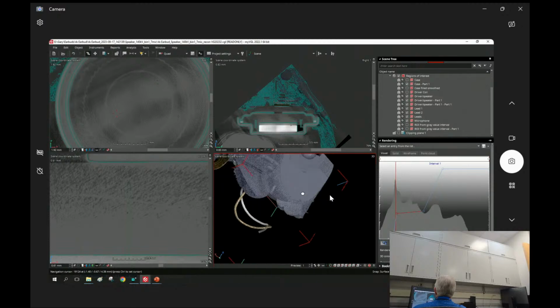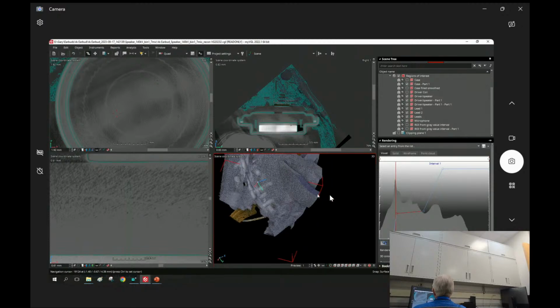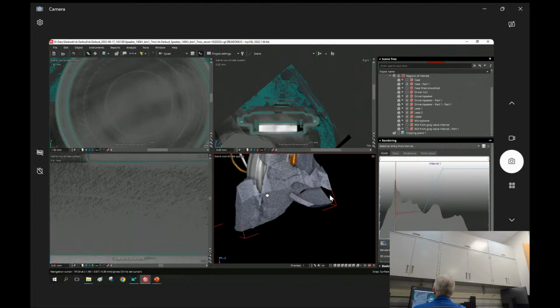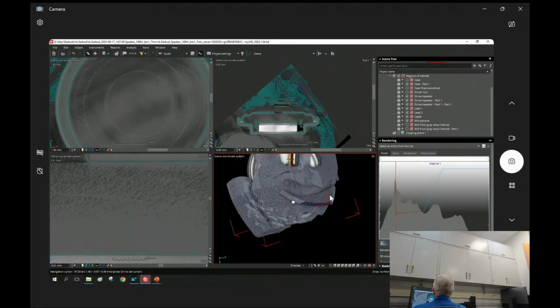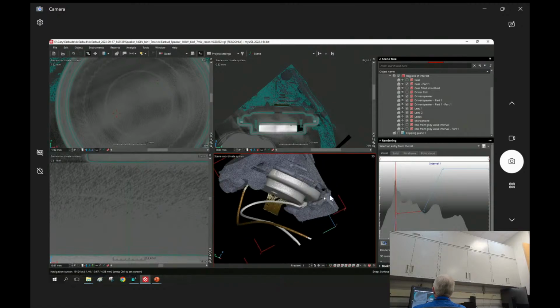So now my polymer is not easy to see, but my silicone is a little bit denser than the polyethylene for the case, or the ABS maybe for the case. So I can see that a little bit more clearly. But from the scattering from all this, because I've got a magnet in there, it's basically nickel iron, it's not going to lend itself well to doing these sorts of analysis. But with some effort, I got them segmented.